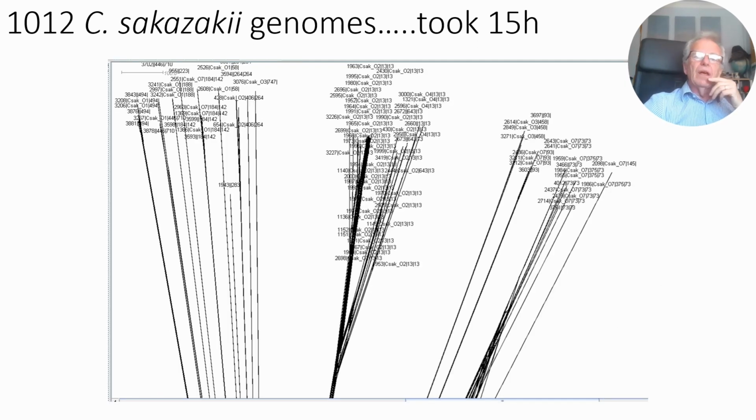Over here, we've got the ones which are more sequence type 13, and various sequence types over here bunching together. And you can see it's interesting because we've got bifurcating going on. So there's strains which are related. When I say related, I mean in the genomic sense, the DNA sequence sense, they are clustering together. These are a little bit more dispersed, but they're great for one to go and analyze further.